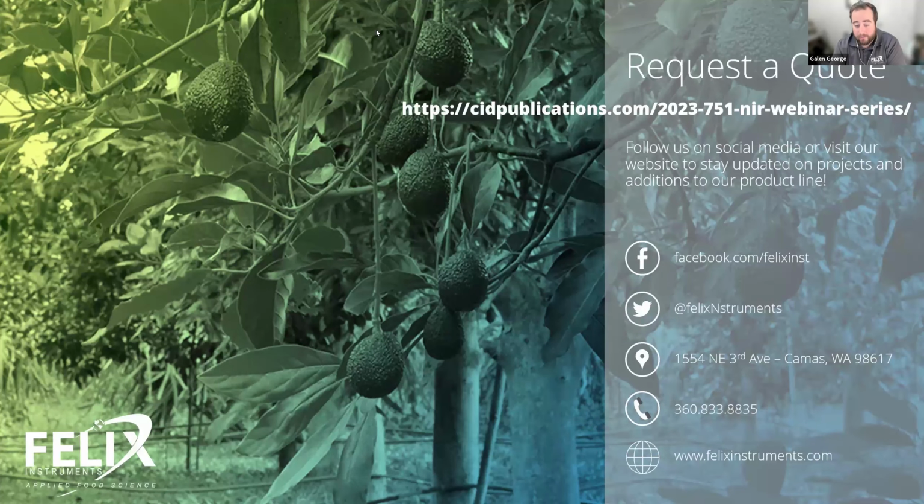And as I mentioned in the model maintenance, you need to have a testing scheme where you're able to regularly test the performance of the device against an analytical method. In the calibration procedures we give to our customers when they purchase a new unit, we provide a visual guide and step-by-step instructions for how to do that, what technology to use, and how to actually perform that testing.